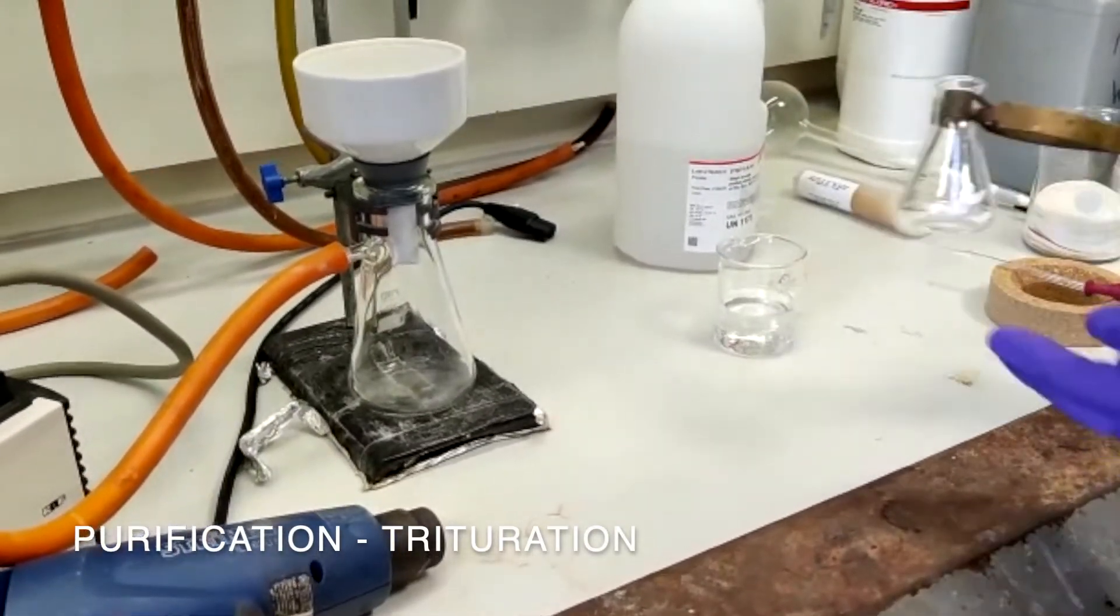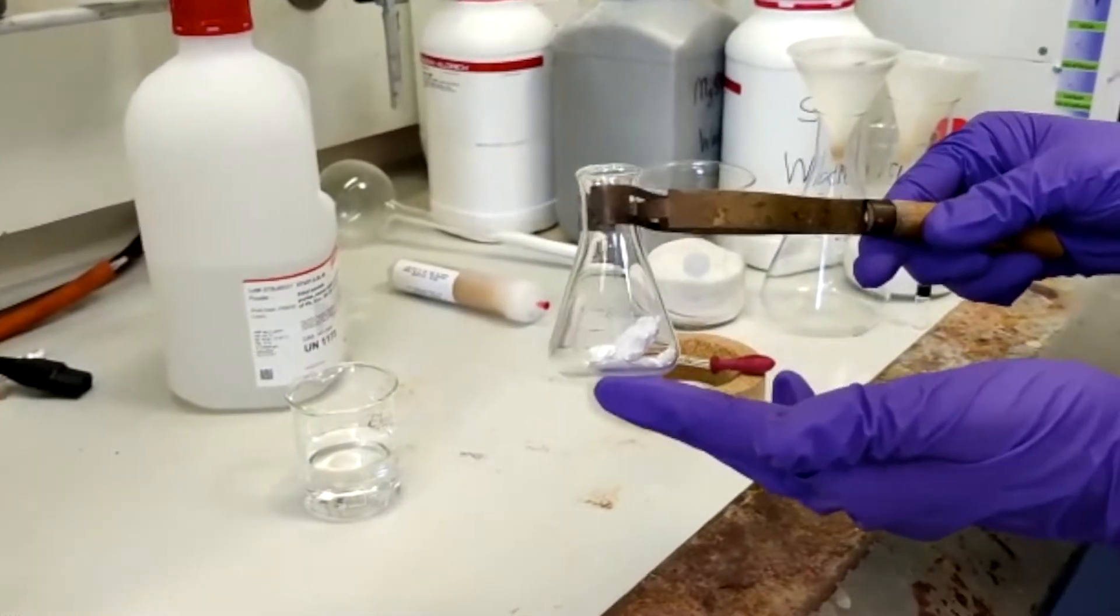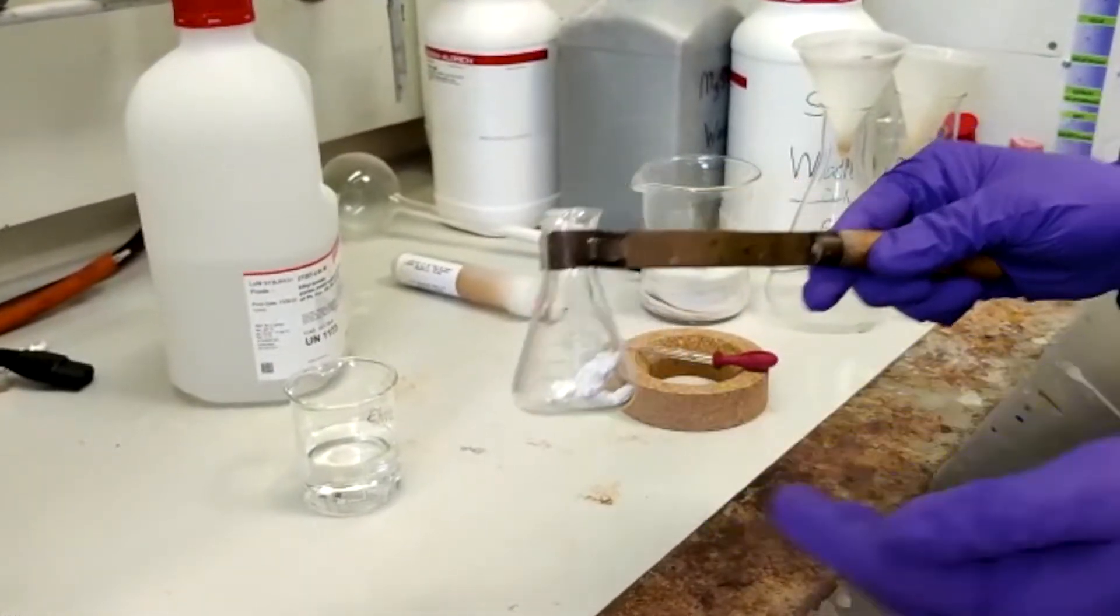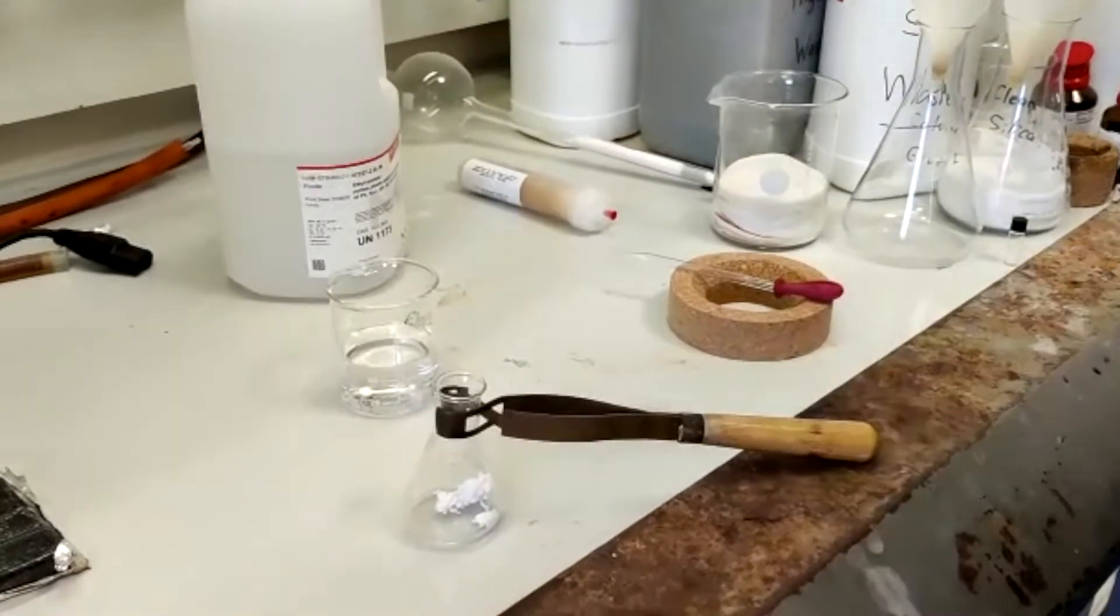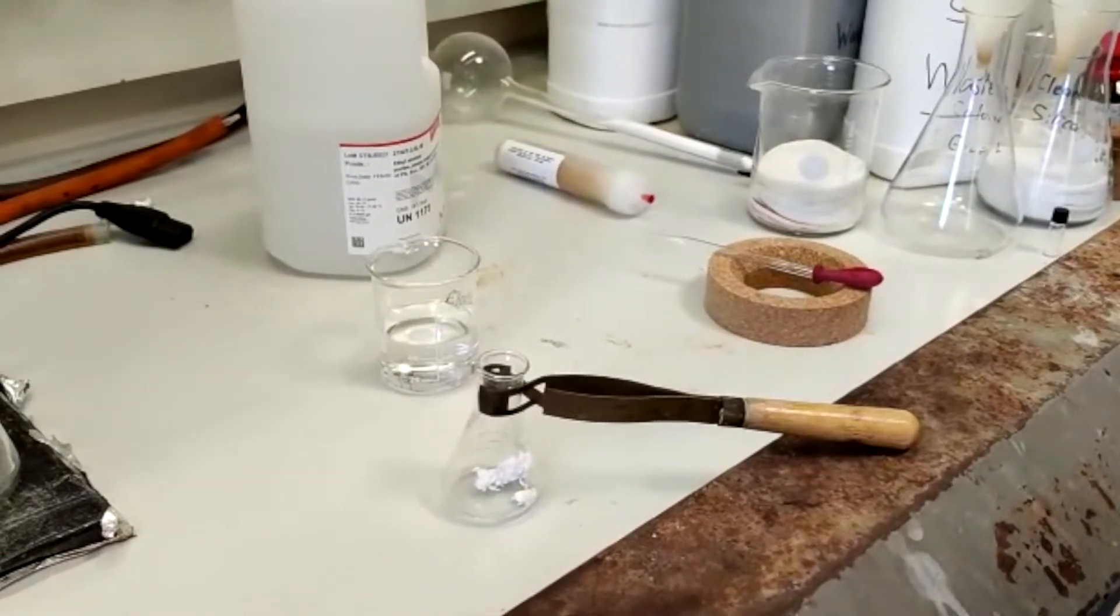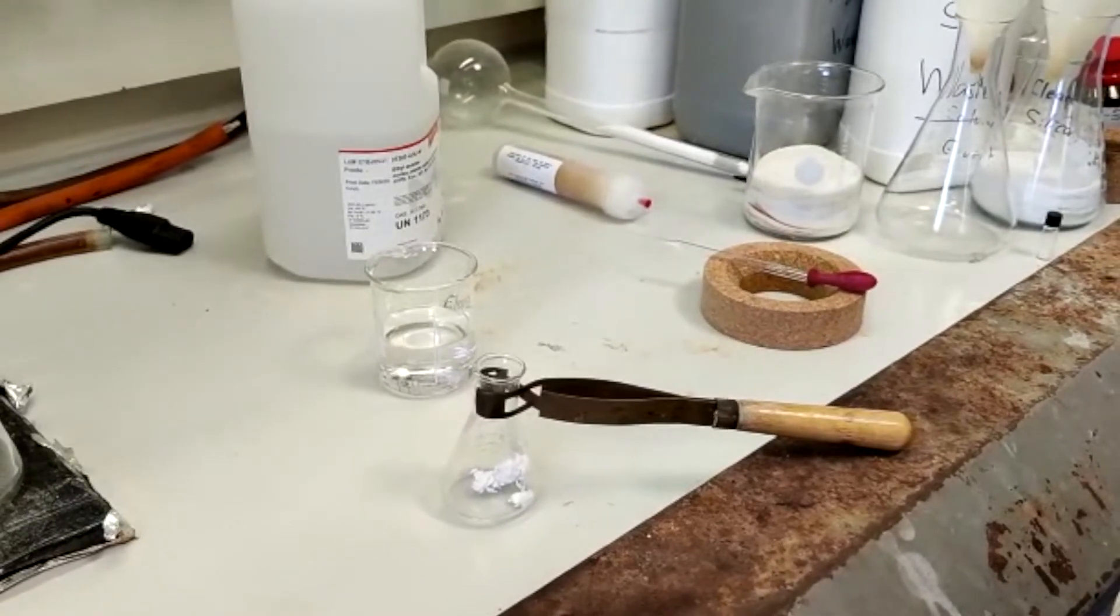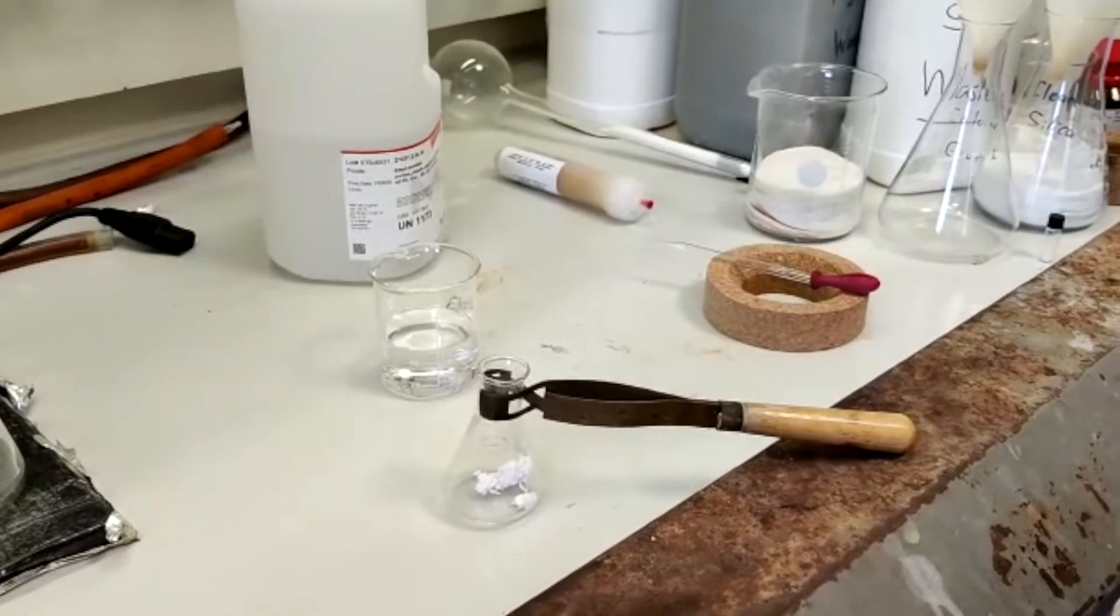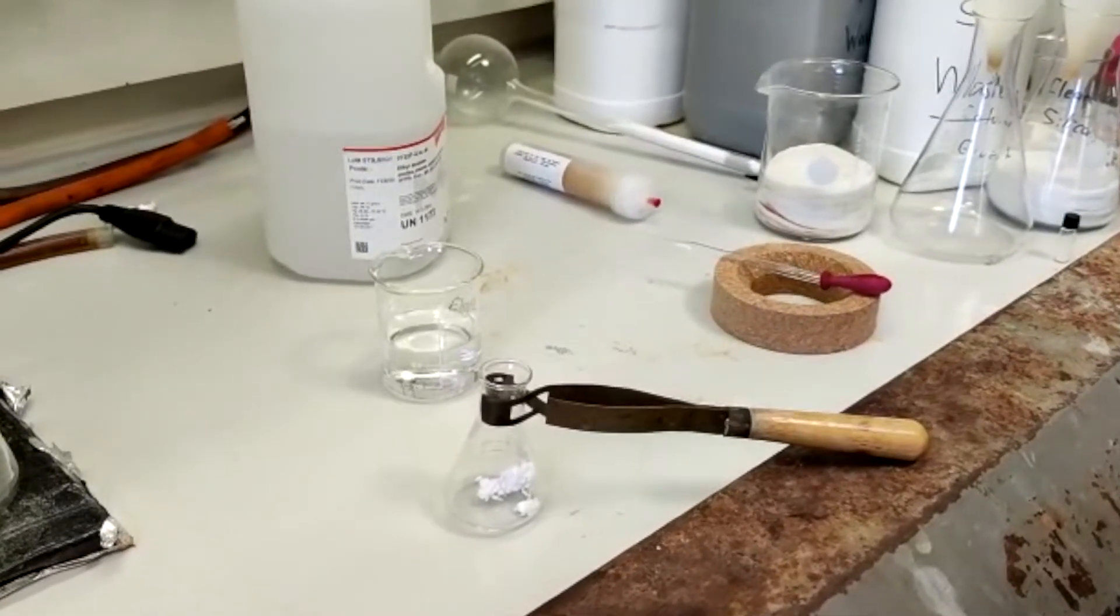As you can see, we've taken the white solid that we got from the first filtration, and we've transferred it to a small conical flask. What we're now going to do is we're going to triturate it. This is very similar to doing a recrystallization, but a lot simpler, in that we will add a solvent that our product is not soluble in, but that our impurities are. We will heat it up, and our product will not dissolve, it will remain a solid, and then we'll just let it cool down, cool it to zero degrees, and filter it in the same way that we have before.